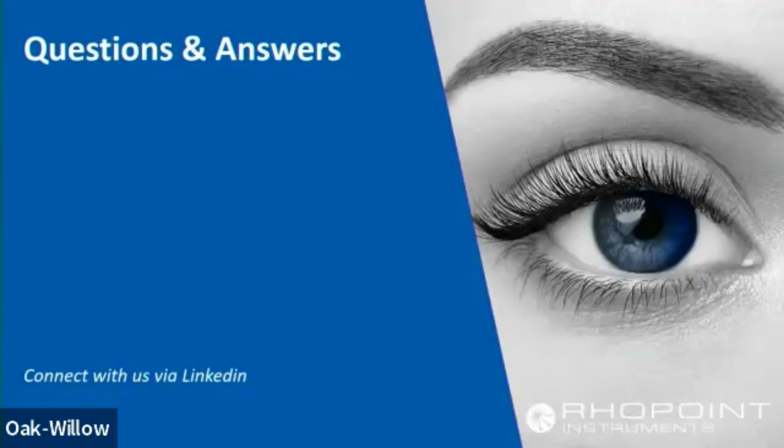Okay, so if people want to understand the height resolution for topography, they can reach out to you and explain it that way. Yeah, 100% yes. Okay, I like that. This is really interesting. The resolution can be as low as 0.1 microns. It's really good when we're resolving these different areas. It interpolates between them and gives us a really nice measurement of the surface.